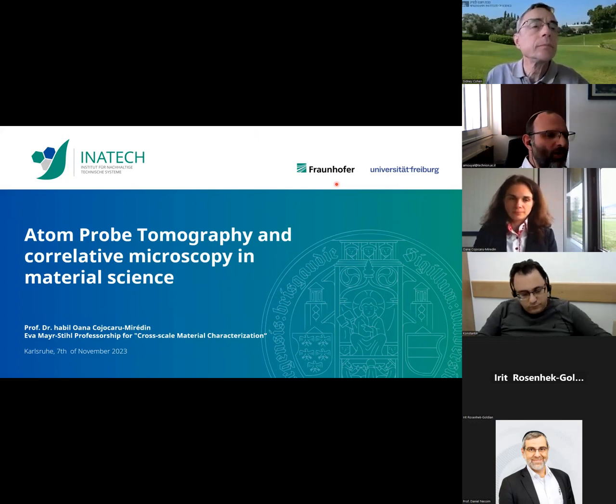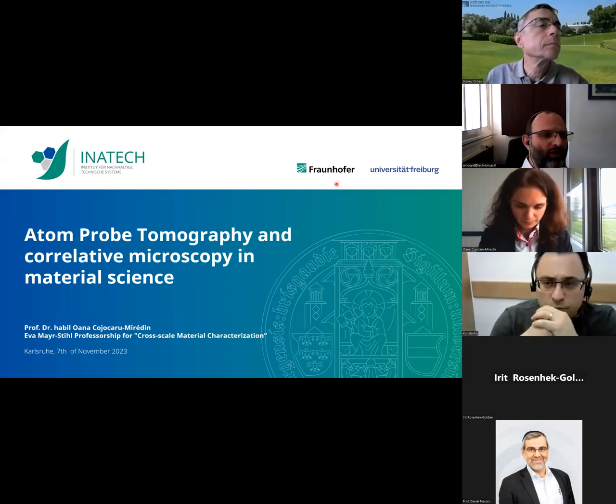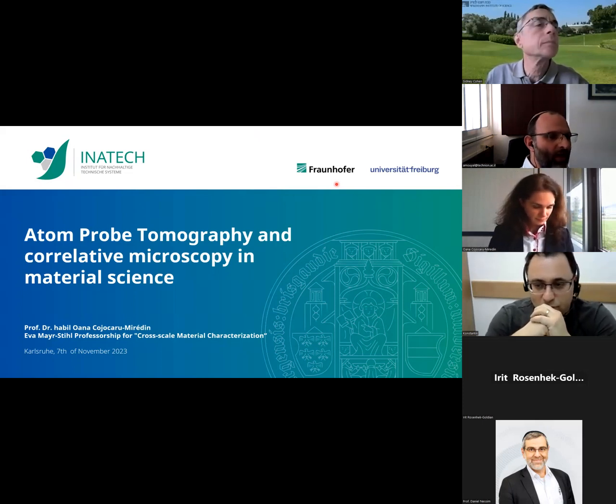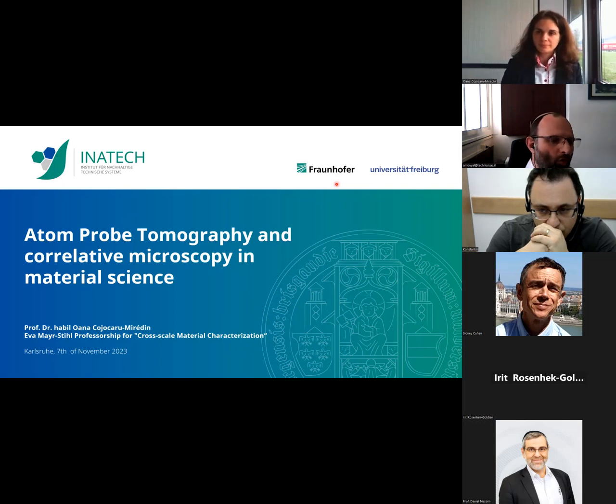This time, we chose to focus on atom probe tomography, which is not very well known so far, but is very important as a complementary technique for electron microscopy and other types of spectroscopy. So for this purpose, we invited a leading scientist in the atom probe tomography community who will be talking on atom probe tomography and correlative microscopy.